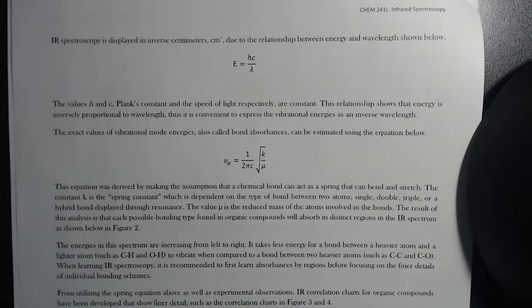All right, next thing here is this portion. That is the spring equation. I remember I learned that in my physics class. Basically, you're looking at spring strength and the energy associated with it, and that's exactly what's happening here. It works out that the spring model gives really good predictions on where the wave numbers show up for different types of bonds.